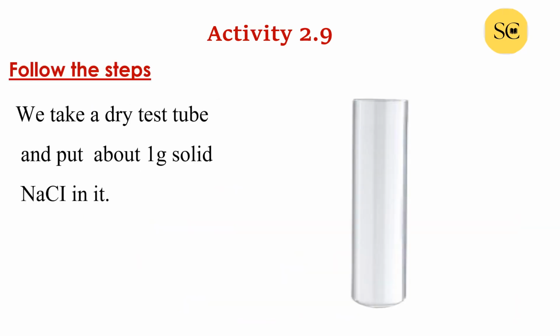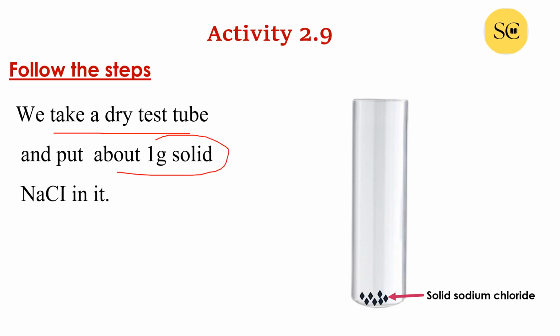Now first we will take a dry test tube and put 1 gram of solid sodium chloride, means common salt. So put some amount of sodium chloride in the test tube.